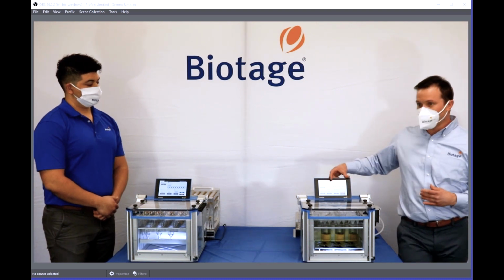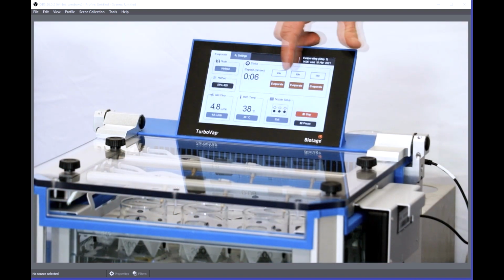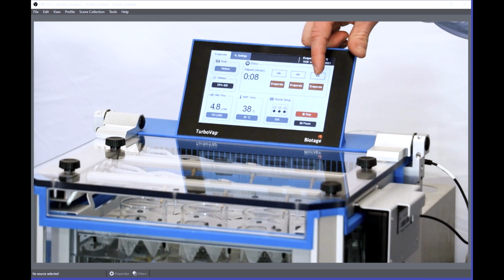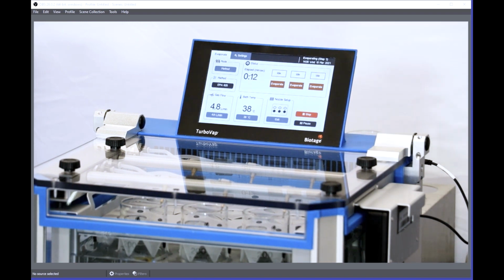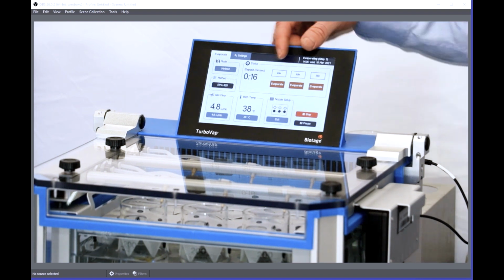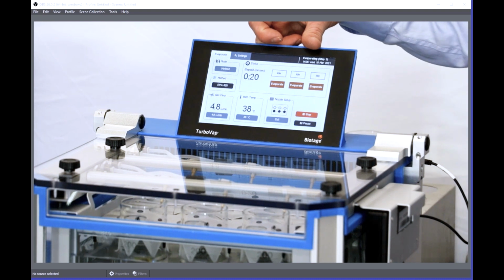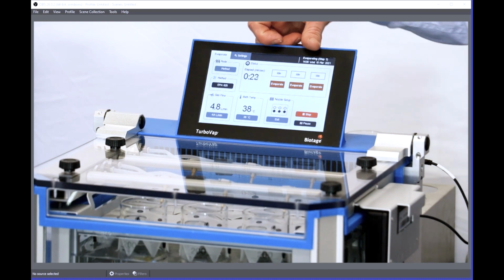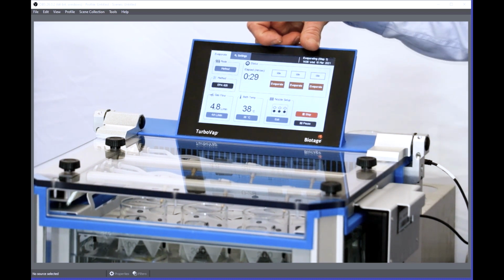And as you can see on the screen, it is actually monitoring each position live. So it will tell you, the analyst, that it is still concentrating that tube, but once it finishes, it will turn that slot, that position, green, and it'll say done. And you can actually take the tube out and move it to the next step in your analytical procedure.